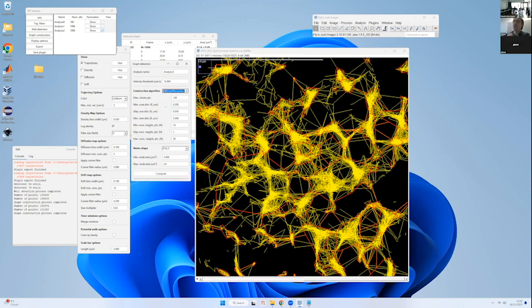So what this will do is start by applying a normal dbScan, and now it will select all the nodes that have more than a certain number of points that you specify. So here it's 100, and it will try to divide them again by applying another dbScan just on these points, but with a bit more stringent set of parameters.